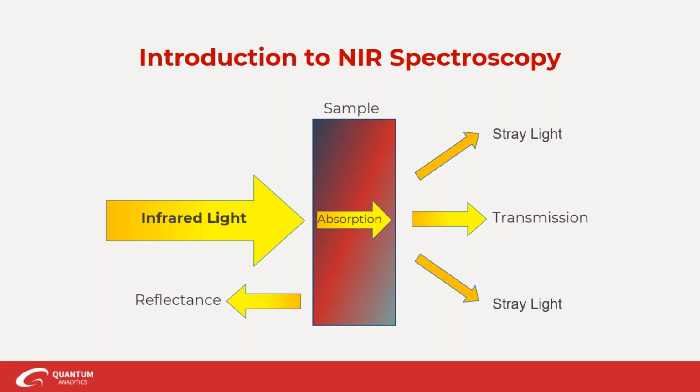Near-infrared spectra create a fingerprint of your sample by light either passing through it or reflecting off of it, and then the subsequent radiation interaction, after which the light is collected by a detector, and that light will include data that's related to both the chemical and the physical properties of your sample.